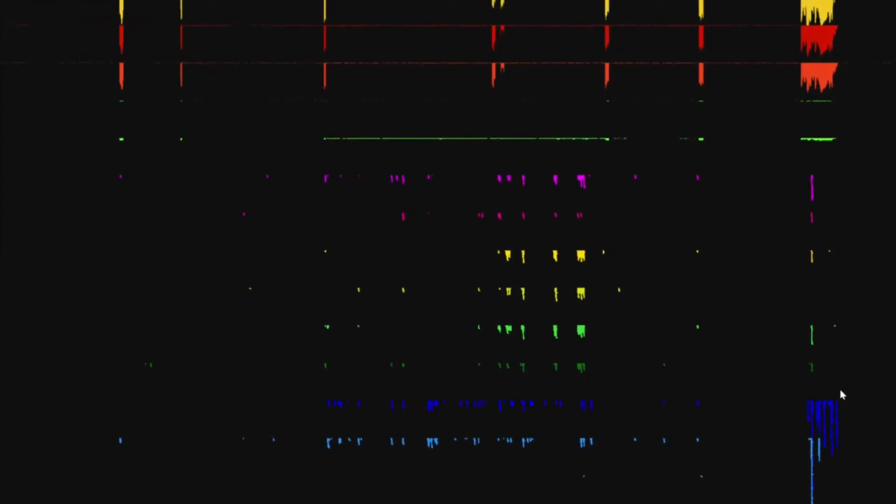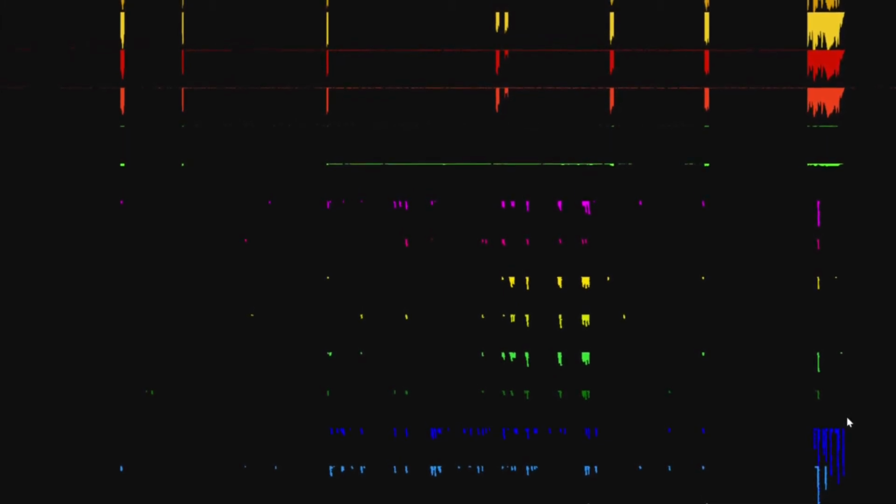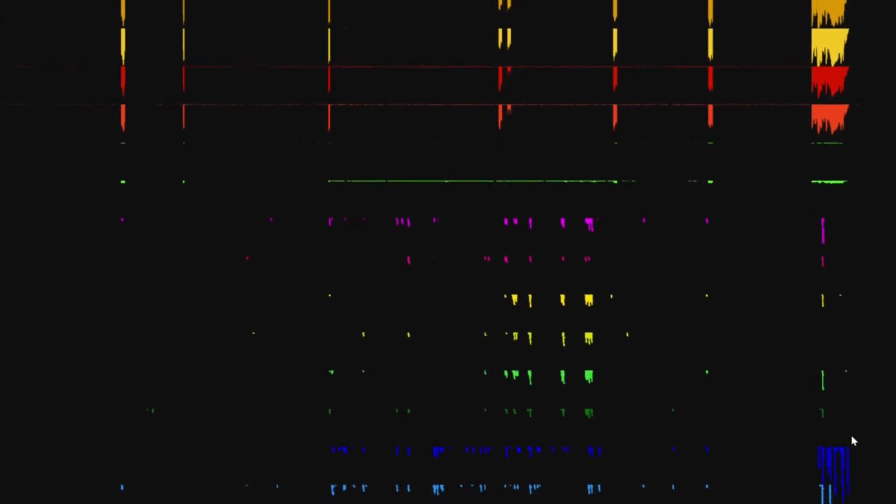This shows us multiple sites of RB-FOX interaction within this gene, located close to the center peaks. There is another binding site at the end of the gene for a different RB-FOX isoform. Zooming in on the central part of the gene, we notice clusters of RB-FOX binding sites on each side of the central part of the gene.